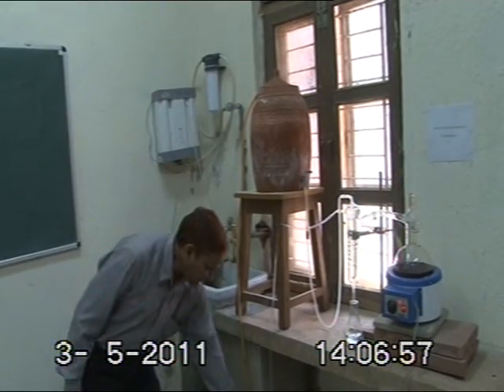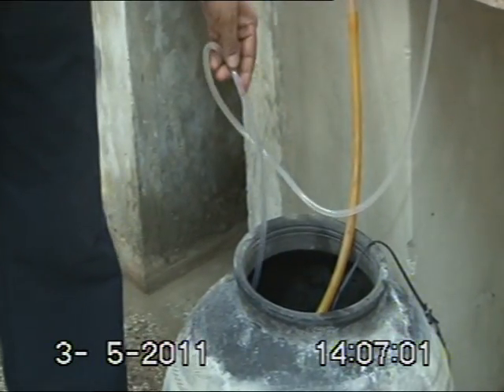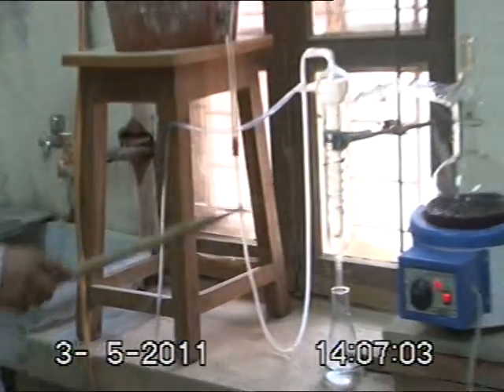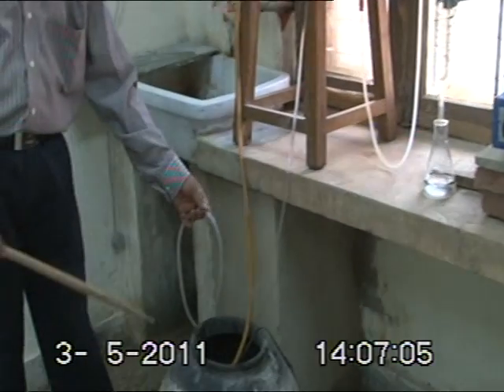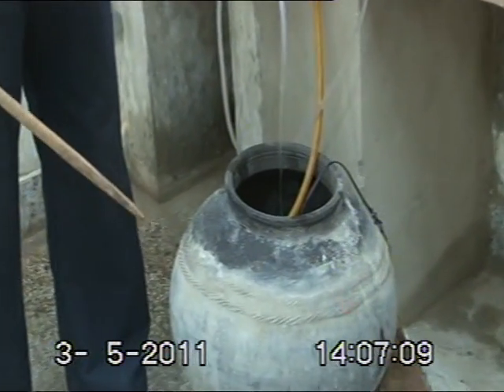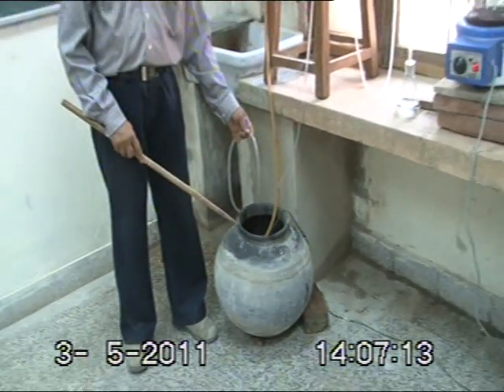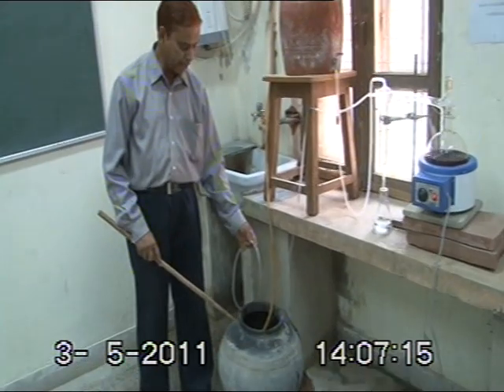In this modified recycling distillation technique, the water coming from the outlet of the condenser tube is collected in this earthen pot — you can see it here. The earthen pot is used because the water coming from the condenser unit is slightly high in temperature.